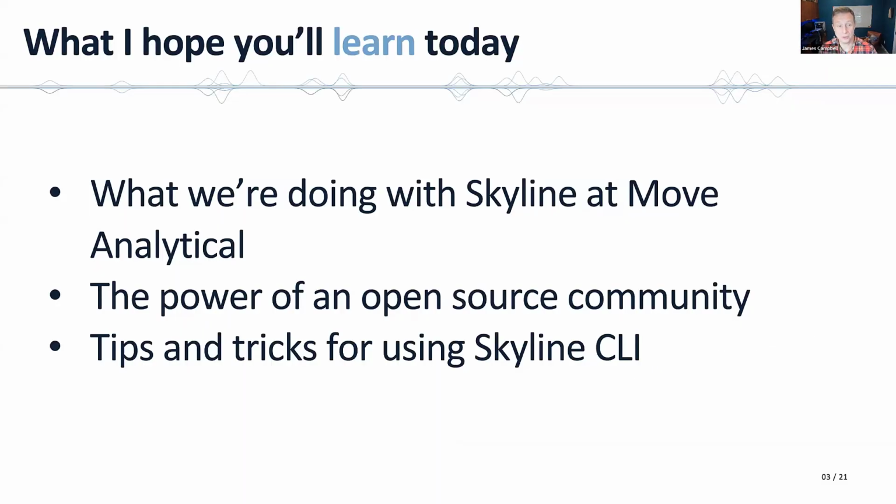What I'm hoping you're going to learn is how we're using Skyline, and hopefully some tips and tricks around using the Skyline CLI. And I am a believer in the power of an open source community. I think it's really apparent when we're using the Skyline CLI how many different people and problems have been addressed through Skyline. You can see it in the breadth of capability that's there, and in some cases the variety of ways that it works together.